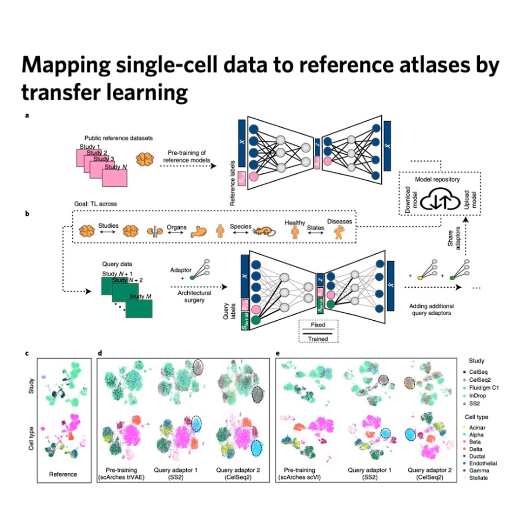So the query data contained a totally new but very similar cell type. Exactly. And scArches placed the new NK cells in their own distinct cluster, but crucially, it placed that cluster right next door to the NKT cells in the map. It understood their biological similarity without merging them. It shows a really nuanced understanding. That's incredible. So it's not just integrating data, it's actually transferring knowledge.